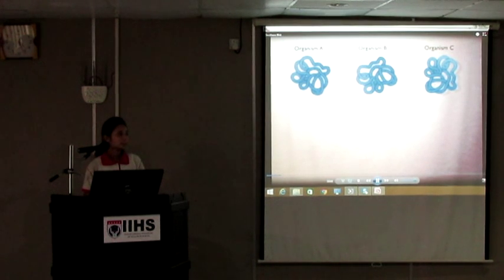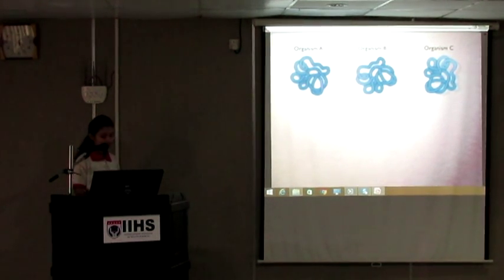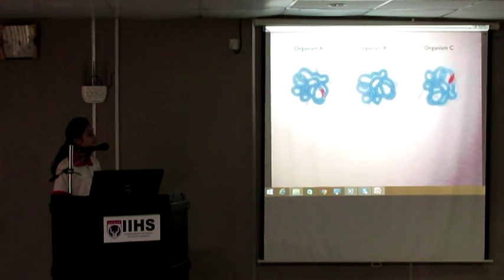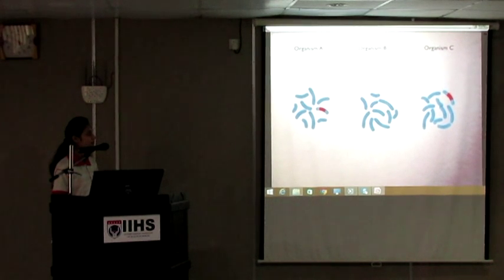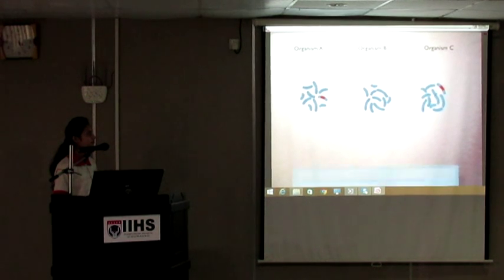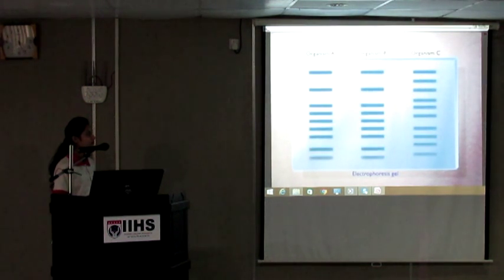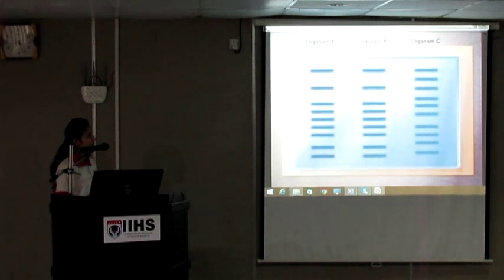Southern blot is used to verify the presence or absence of a specific nucleotide sequence in the DNA from different sources and to identify the size of the restriction fragment that contains the sequence. In this procedure, the DNA is isolated from each source and then digested with a specific restriction enzyme. The DNA restriction fragments are then loaded onto an agarose gel and separated by electrophoresis according to size, with the smaller fragments migrating faster than larger fragments. The DNA is then transferred from the fragile gel to a nylon filter.